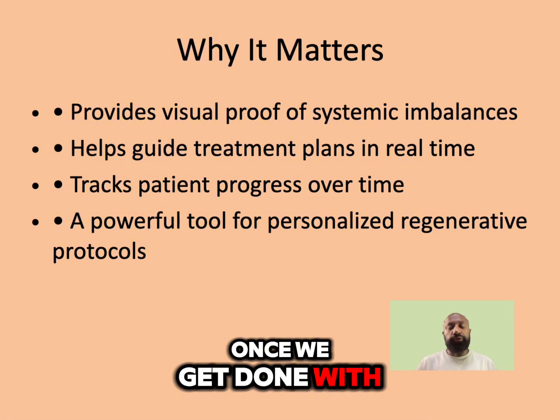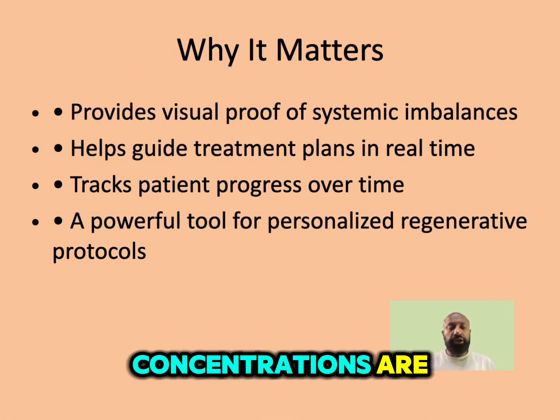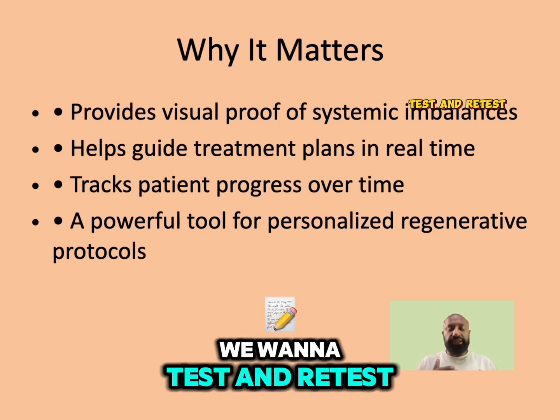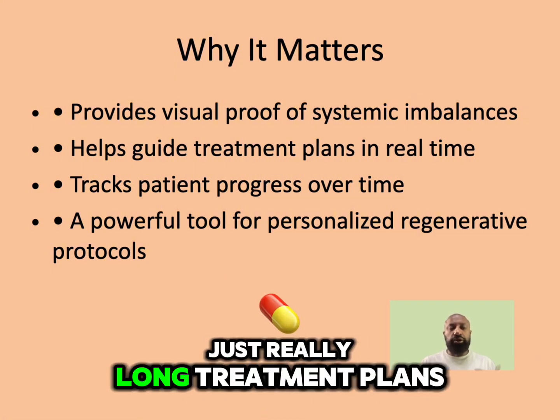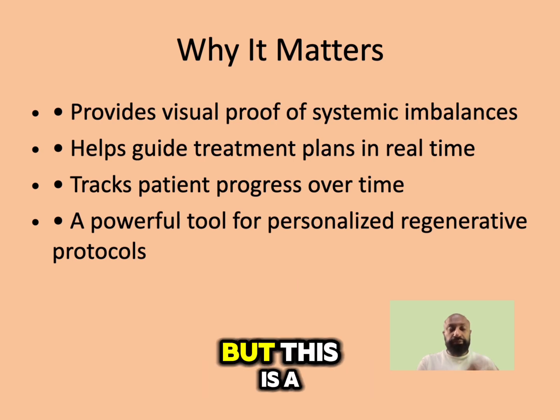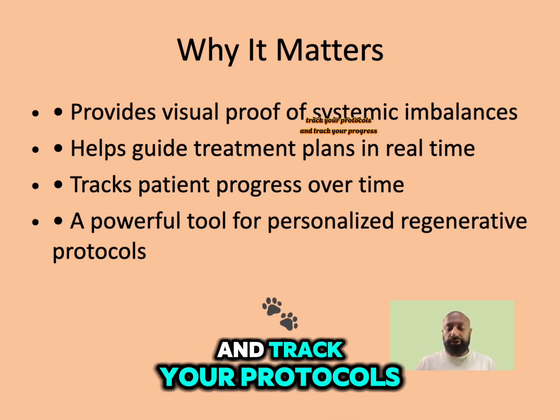Once we get done with our treatments, we'll actually analyze to see what those spike concentrations are. Same thing with any type of infections. We want to test and retest, whether it's a blood test or a darkfield microscope. We don't like doing just really long treatment plans. We want to see a really good result as fast as possible. But this is a good tool for us to be able to personalize it and track your protocols and track your progress.